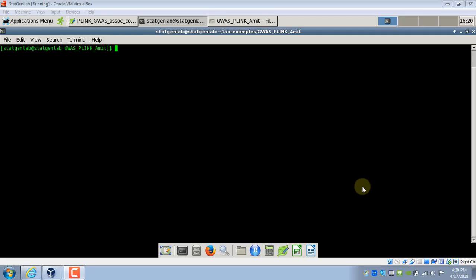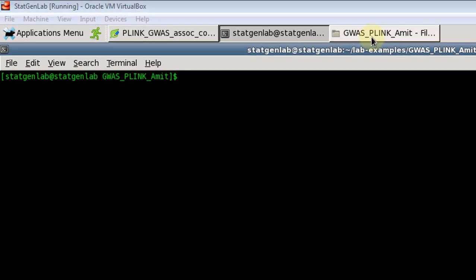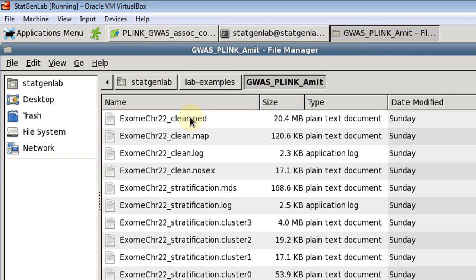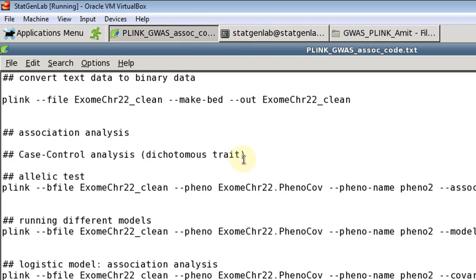Hi, in this video we are going to see how to run GWAS using software Plink. For this analysis we are going to use the first two data sets: the exome chr22 underscore clean dot ped and dot map. In our previous video about quality control in GWAS using Plink we created these two data sets, so if you have not, then I'll recommend you to watch the video about quality control in which we show how to create these clean data sets.